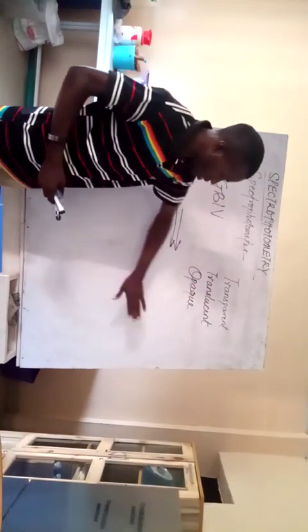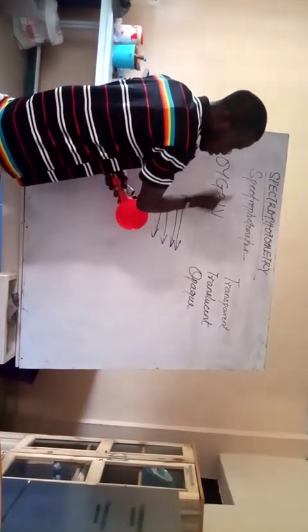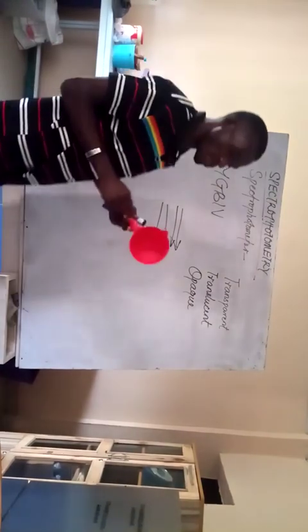So, for example, this marker, you can see a blue tint here. Or look at this material. This material, for example, appears red because all of the white light that is striking it, it is absorbing all the spectrum of light, the orange, the yellow, the green, the blue, the indigo, and the violet, but it is only reflecting the red.